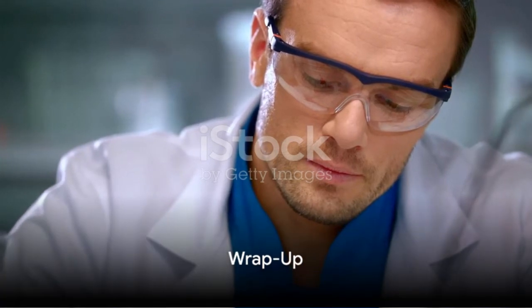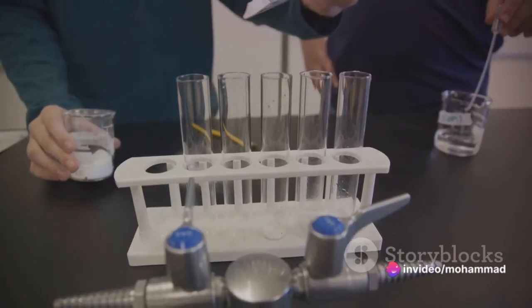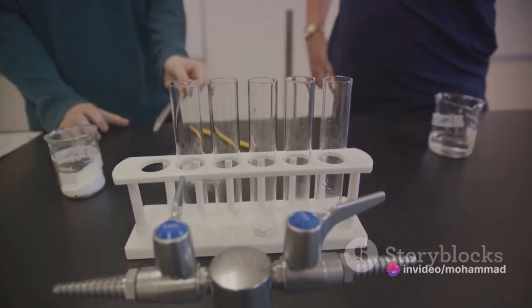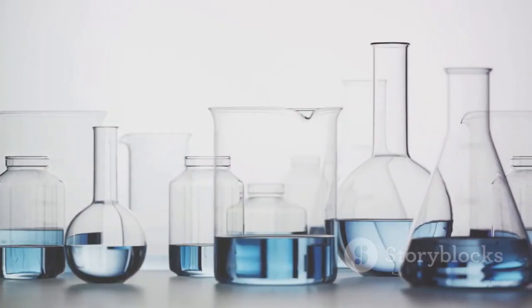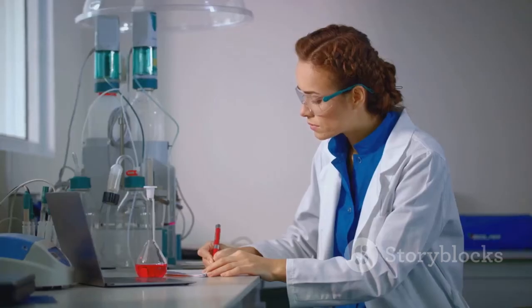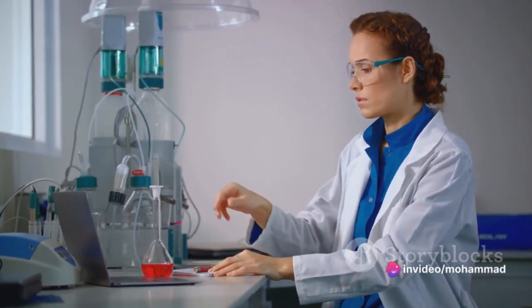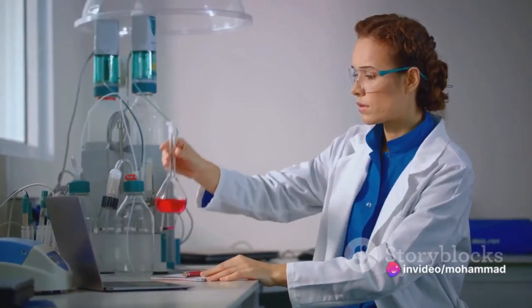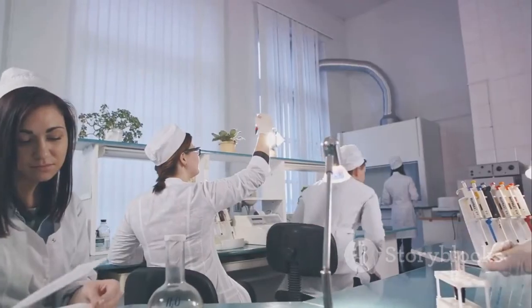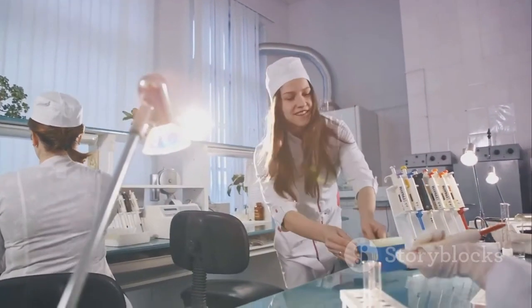So, there you have it, a quick guide to the fascinating world of gas chromatography. We've explored that it's a method used to separate and analyze compounds with its own unique components. We've uncovered the different types, each with their own special applications. And of course, we've discussed its strengths and limitations, showcasing the importance of this tool in scientific research. Next time you encounter the term gas chromatography, you'll know that it's not just a fancy term, but a powerful tool in the world of science.